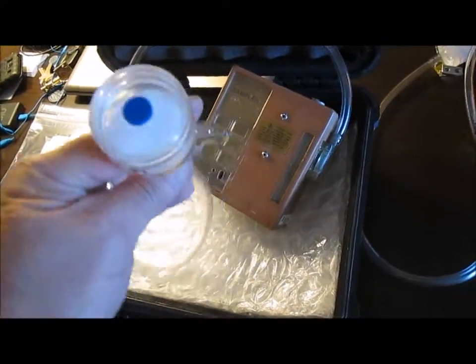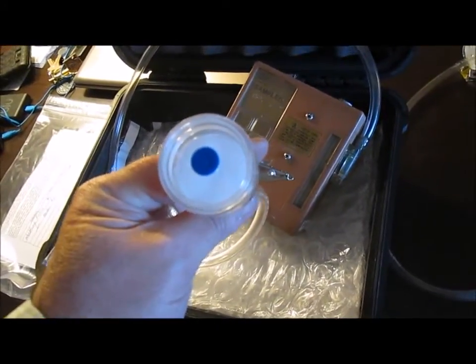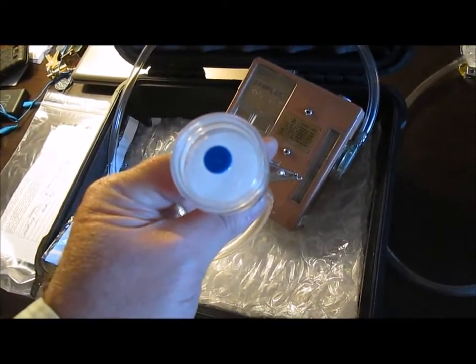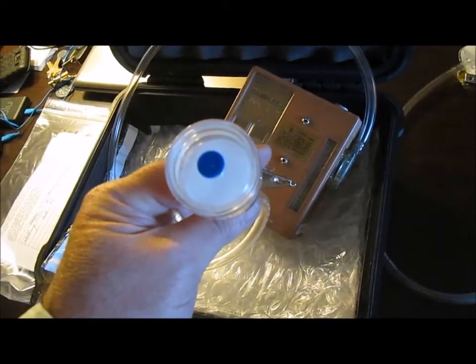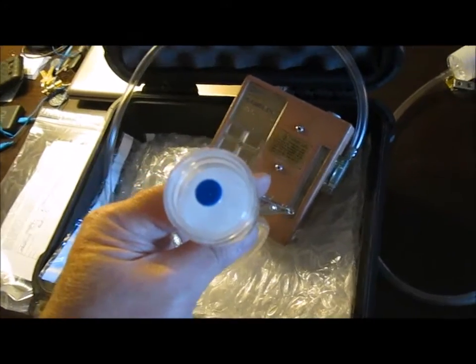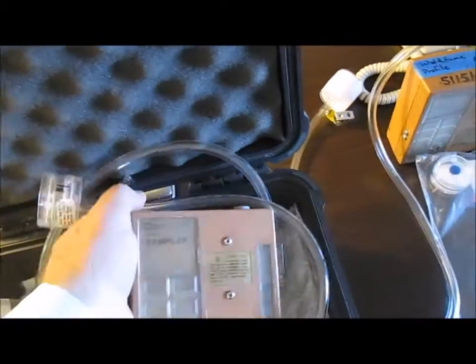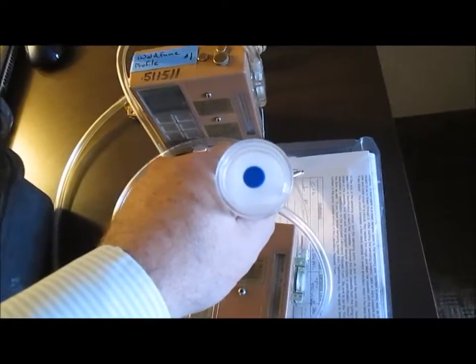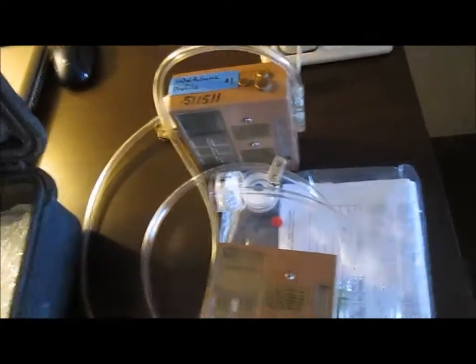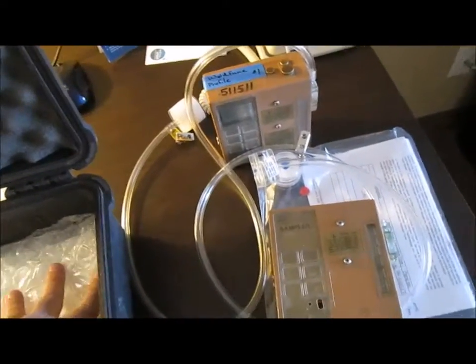Then I send it to the lab. The cartridge starts out as a white color, and generally depending on how much fume there is during the process, it will turn to a tan, brown, dark brown, or in some cases I've even had it turn dark black. The color of the cartridge being dark or black does not necessarily indicate that the test result has been very bad.